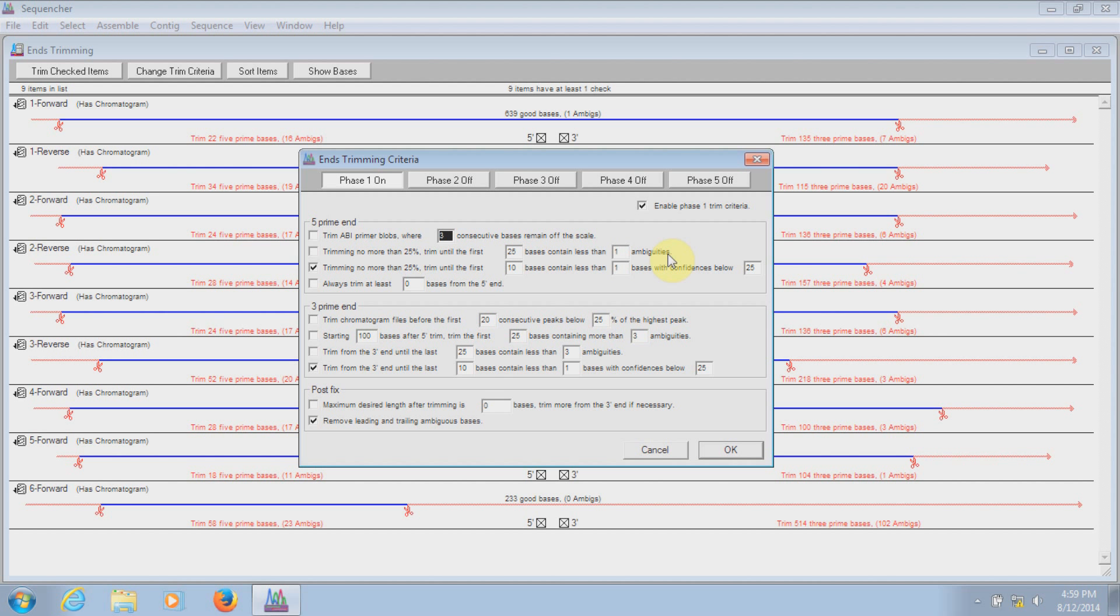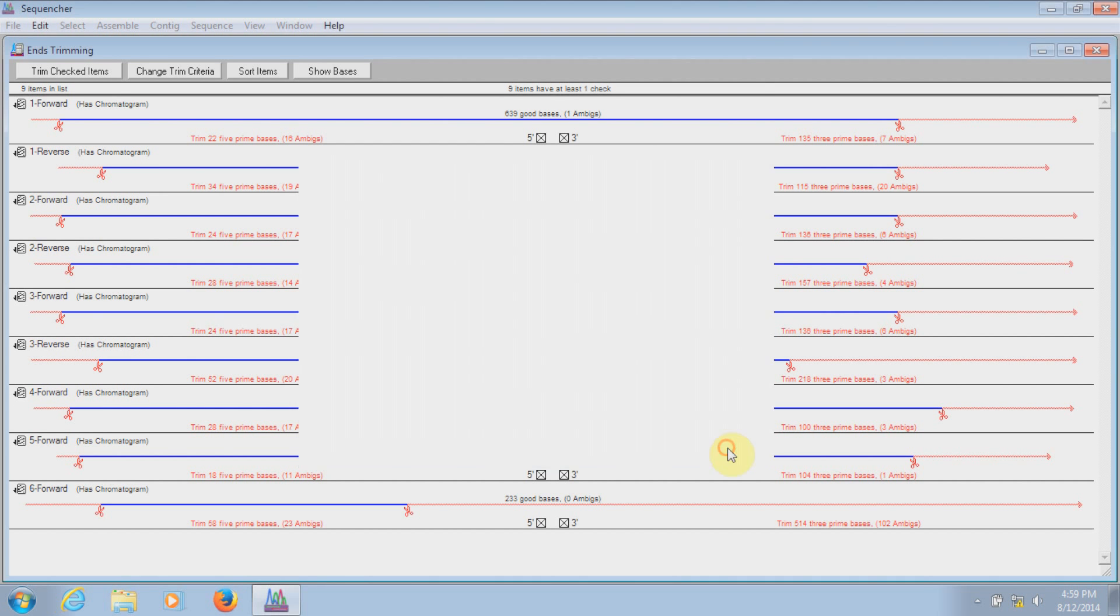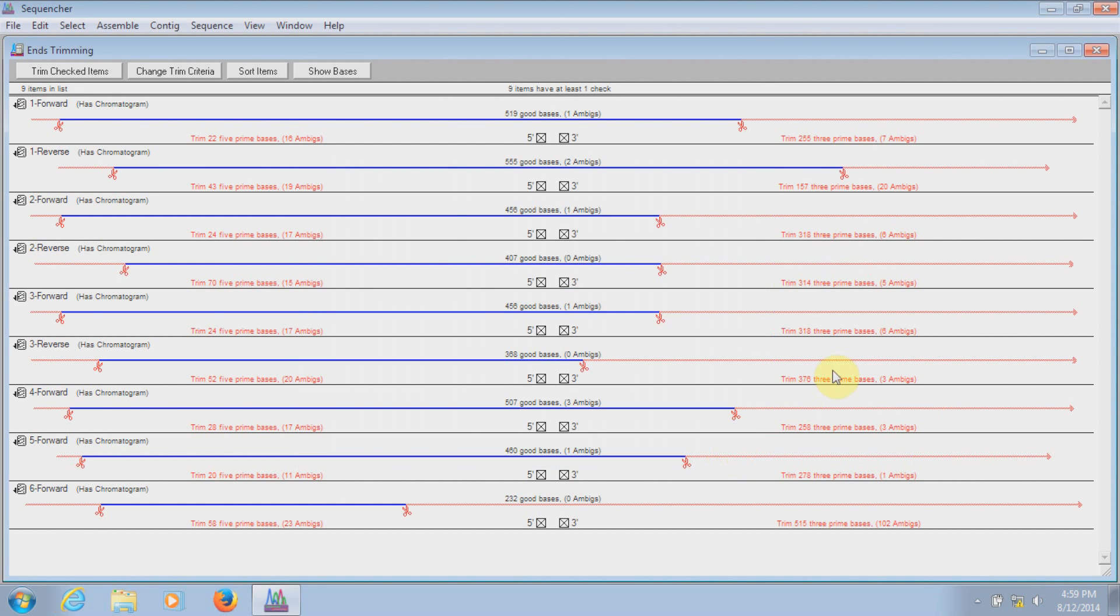Sequencher allows you to set different levels of trimming criteria and turn them off and on depending on how strict you want to be. Right now, you can see how much of the data will be trimmed if I use the Phase 1 criteria. Now, let's turn on the Phase 2 criteria and click OK. And you can see that many more bases will be chopped off now that we're using the Phase 2 criteria as well.